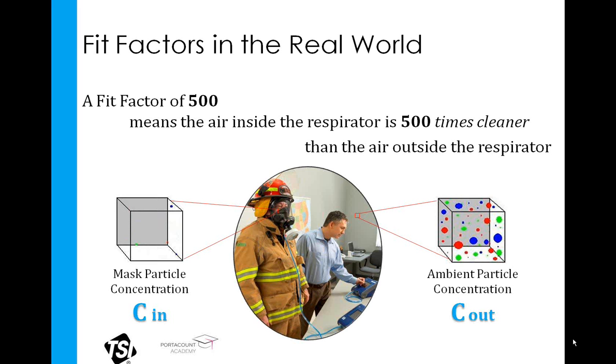But I want to take pause at this point and point out that we don't want you to draw the conclusion that therefore you need to achieve the highest possible fit factor you can, and that would mean that you are that much more protected. For example, I must be more protected if I have a fit factor of 20,000 than if I had a fit factor of 2,000. That's not the point.